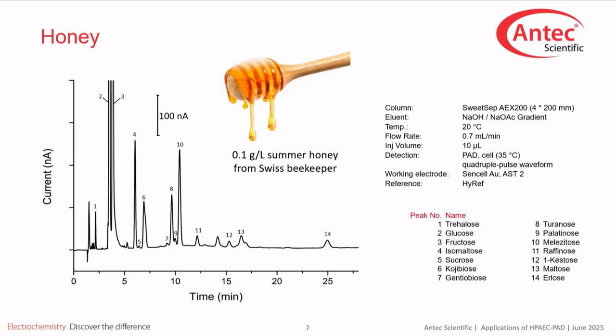The Codex Alimentarius outlines the minimum fructose to glucose content and maximum sucrose content, and it's interesting to note that the fructose to glucose ratio can differ amongst various uniflora honeys. The honey sugar fingerprint can help tell apart blossom honey from honeydew honey and evaluate uniflora purity, where HPLC-PAD plays an important role. On the chromatogram, you see peaks for glucose and fructose.